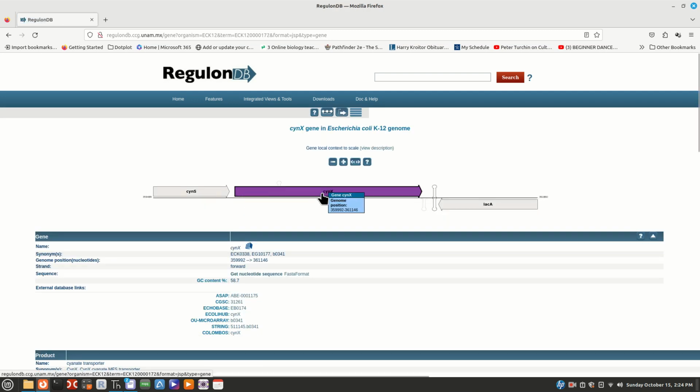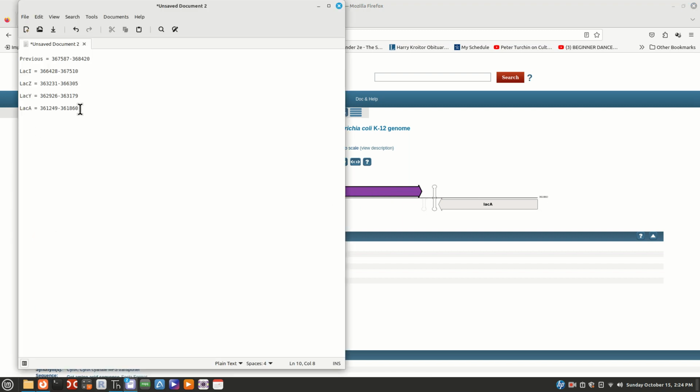But here I want to get this one because we're pretty sure that it's not going to move into this one, though that does occur. Occasionally you'll have genes overlap. This is indicating they do not. But you might have one gene running into a part of another one. It happens, going in the opposite direction. So this is 359992. So 359992. So let me write that down.